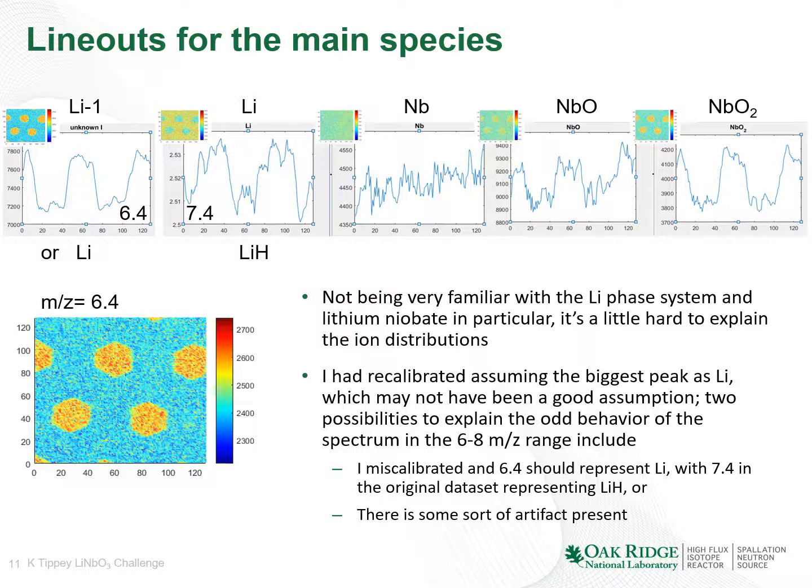They have opposite responses, which would make sense if it's a polarity-induced type difference. Niobium, you wouldn't expect much of a difference across the profile because there isn't anything. Niobium oxide, we start to see peaks and valleys, and niobium dioxide shows increased contrast between these.